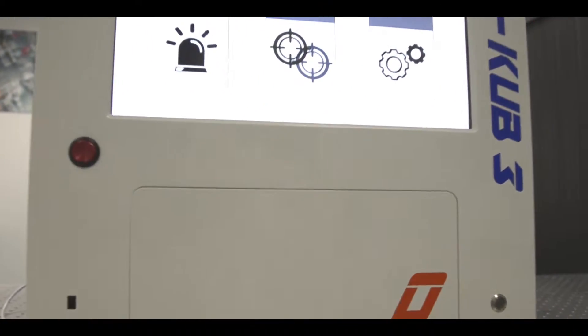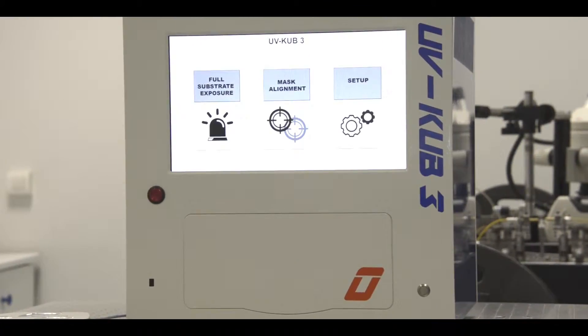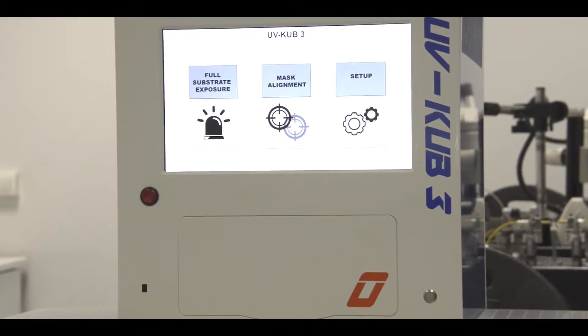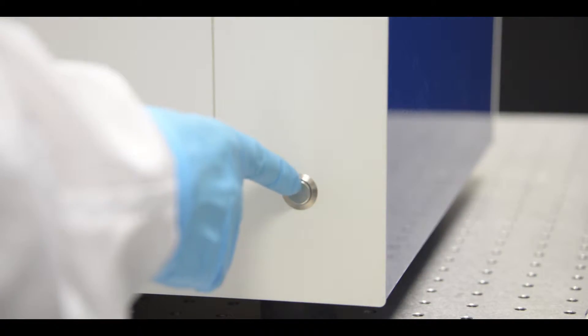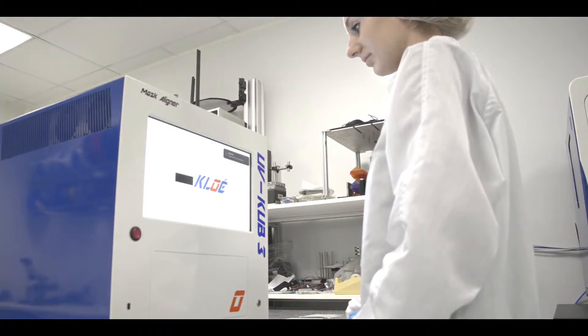Completely secure due to its completely airtight hood, this equipment is currently the only solution on the market today democratizing precision photolithography without requiring a cleanroom-type environment.